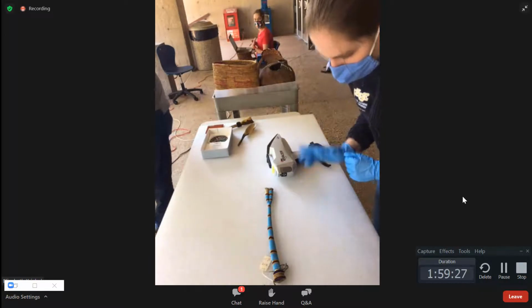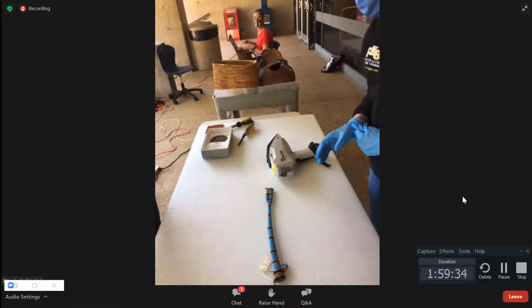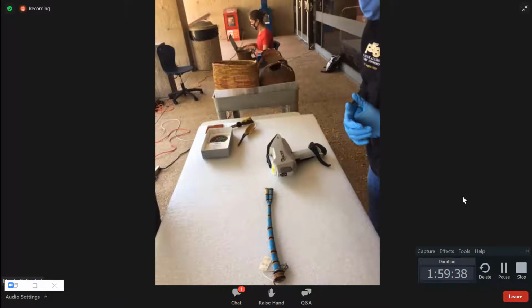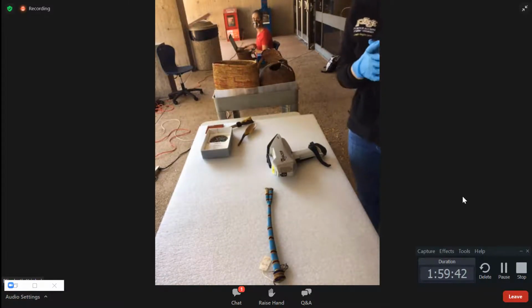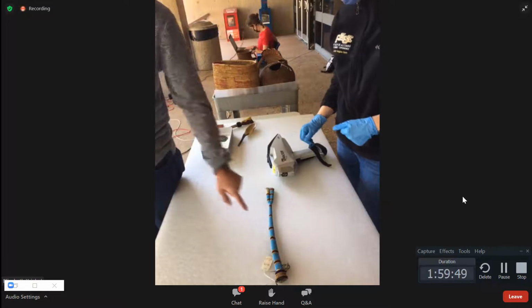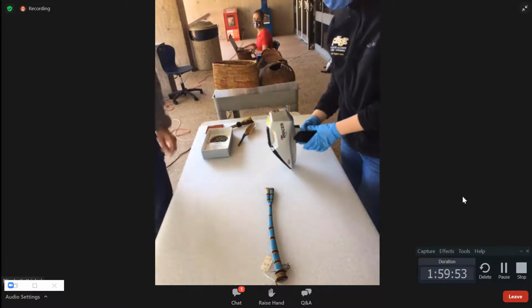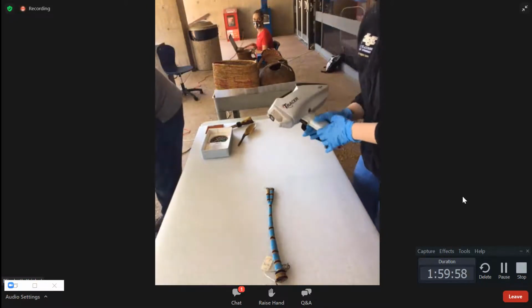All right. This is number 75.8. I wish Andy was here to tell me what this was. I have no idea. Tag says it's an awl. Oh, yes, okay. It's decorated all over. Yeah, no kidding. I would have never guessed a functional tool. So for this, why don't we measure where the beads are missing so we get a sense of the interior, and then we can just measure one color of the beads. The beads are going to be all lead though. It's just going to be color pigment information, but that will be our best shot for what's on the inside.